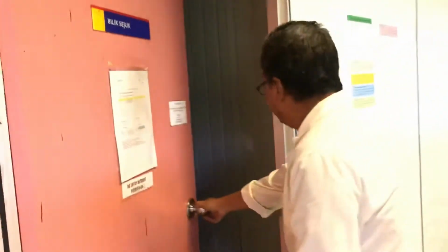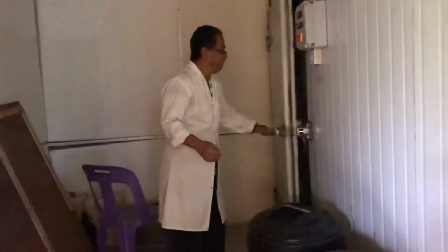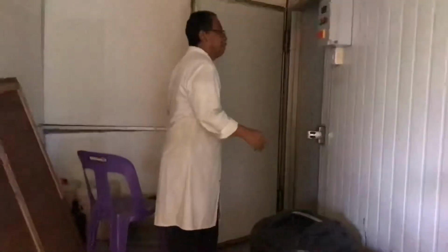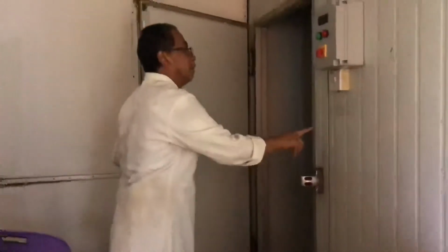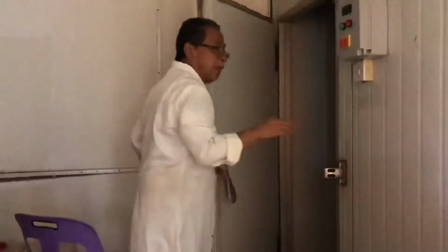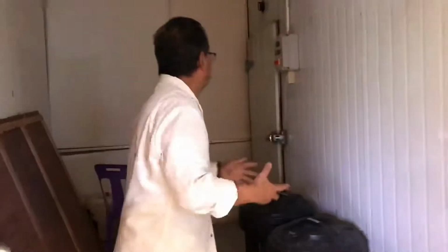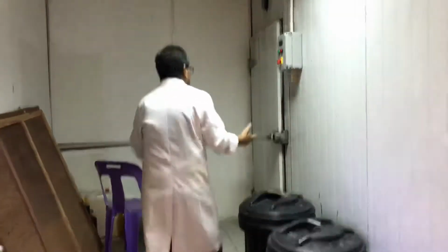And this is the, no lights. Actually, I cannot find the light in this room. This room is a cold room. All samples you collect, you put here in the cold room.